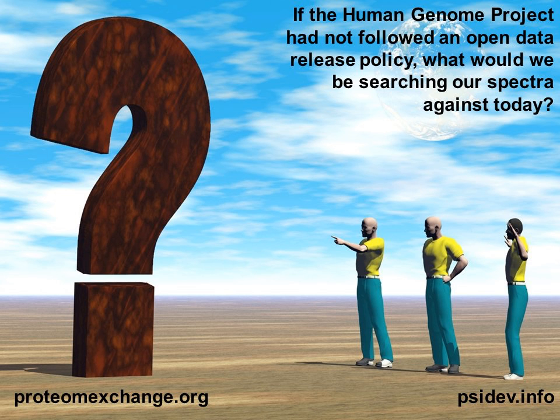Besides mass spec, are there other significant platforms in proteomics, for example, protein sequencing? That's again a question for Henning. There are other proteomics platforms. The foremost one is probably based on antibodies, and more frequently, other alternative antibody formats.